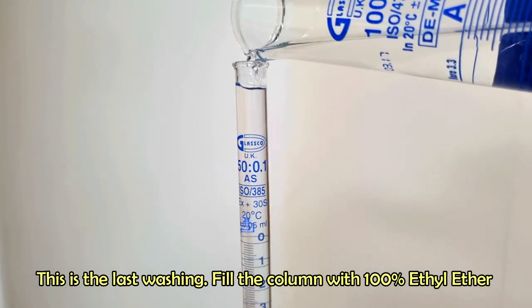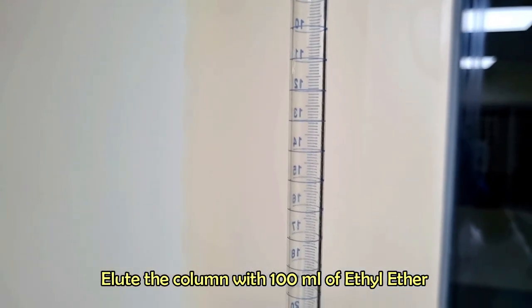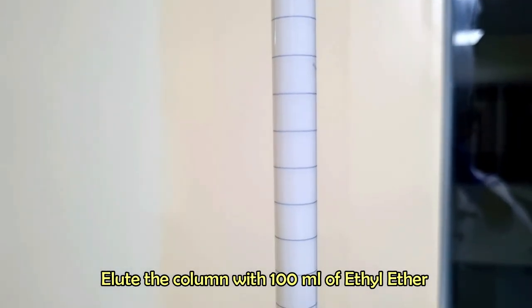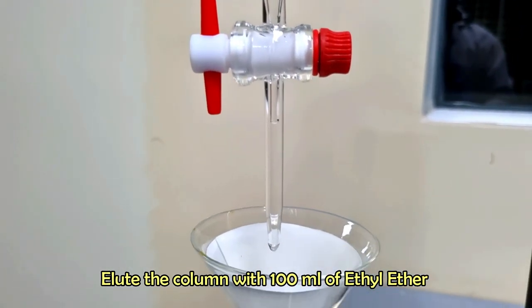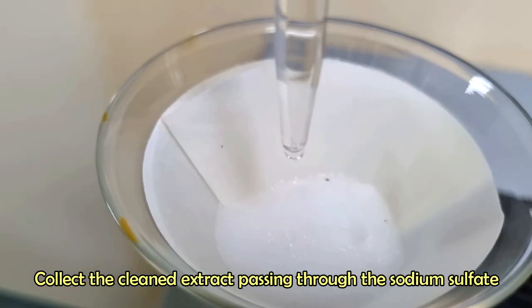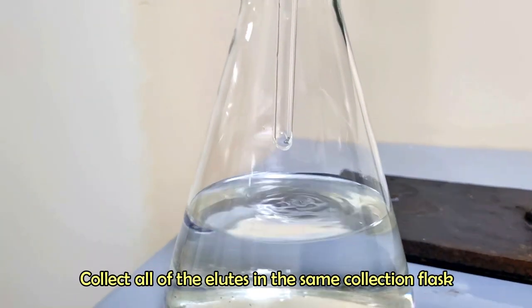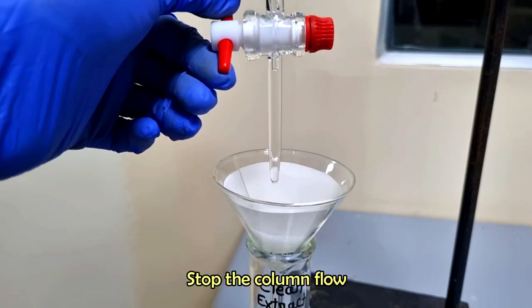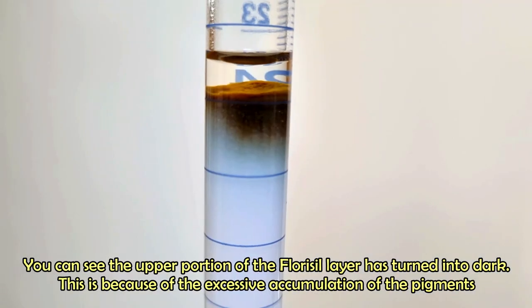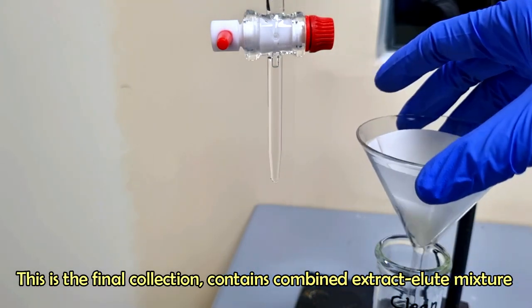Perform a final elution with 100 ml of 100% ethyl ether, collecting the eluate in the same collection flask. Collect the cleaned extract into the collection flask passing through the sodium sulfate. This type of filtration is done to remove any trace moisture present in the cleaned extract. Stop the column flow when the florisil upper layer is nearly exposed to air. You can see the upper portion of the florisil layer has turned dark. This is because of the excessive accumulation of the pigments.